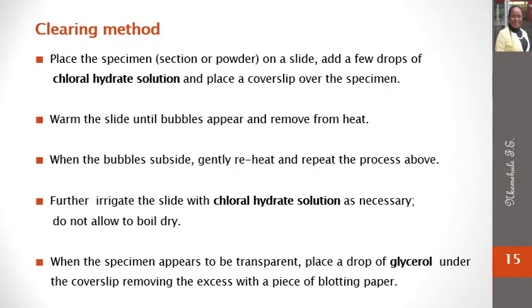For the clearing method, a clearing reagent is required. Warming gently, but make sure to cover your sample with a cover slip and keep your slide constantly irrigated until you get a clear epidermis.